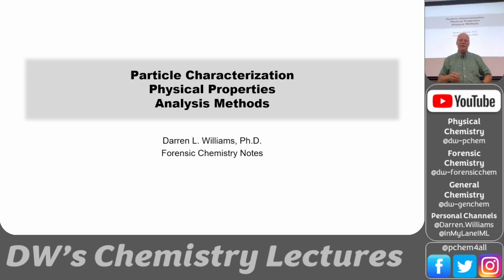Okay. And so today we're going to talk about particle characterization, because that's one other physical property that's really not talked about much. And you'll see there's a couple of figures in here that are pretty dramatic in terms of what the particle distribution can tell you. But this is really just sort of to round out the last thing.